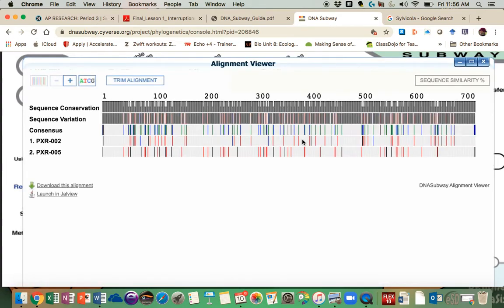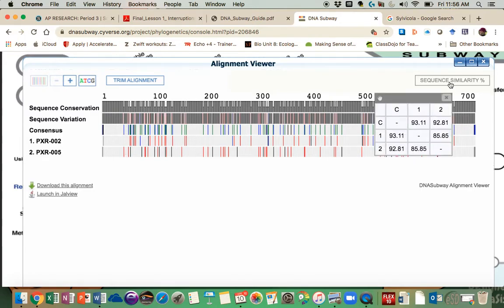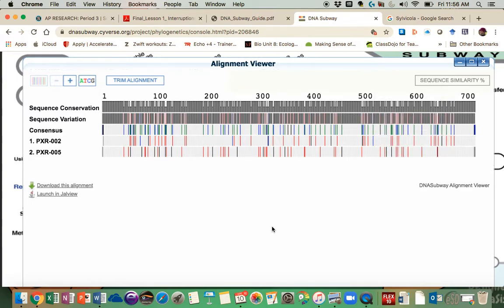And then when you open it, you're only looking at those, right? So now we know this is location 1. You can put the species name that was identified from the blast hits here. And then you can take a screenshot and do the comparisons, okay? You can also do that with the sequence similarities here too in a very small table. All right, so I would do that.